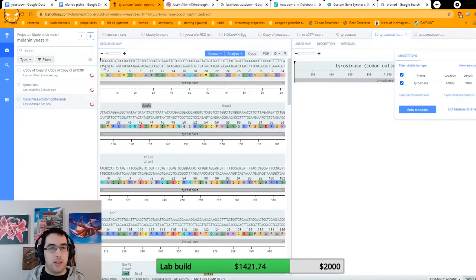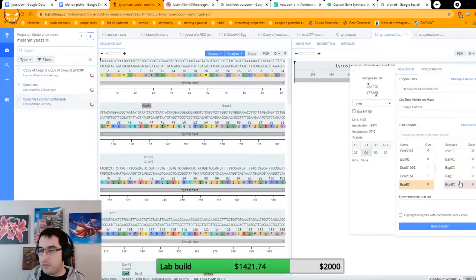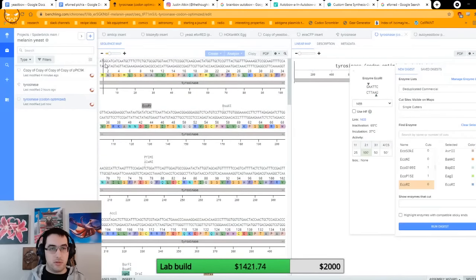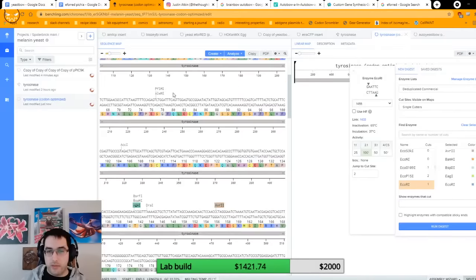Cool. Now I need to add a cut site to both ends. I already have this one because I use it all the time. We need this, copy. I know that it's safe to copy this in directly because of the plasmid I'm using and where it cuts. So if I go translation forward, good, perfect. All that mumbling is basically to say, if I use this restriction site where I'm putting it, it'll all be in frame, it'll all work great, it's not going to be a problem.